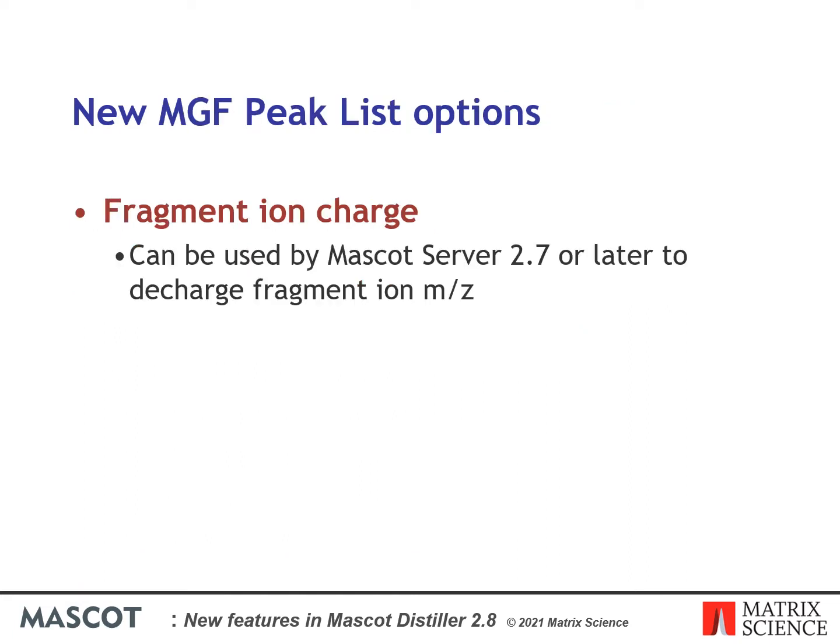In Mascot Distiller 2.8 you can output a number of new features into any MGF peak lists generated. These include the charge of the individual fragment ions. Mascot Server 2.7 or later can use this information to de-charge the MS/MS peak list, which is important if you have charge states greater than 2+ and can improve the results for these types of data.